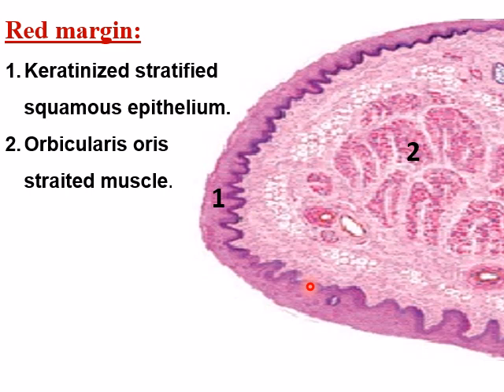As you see here, dear students, this is the red margin. Between the skin and the mucous membrane, there is a margin known as the red margin, covered with keratinized stratified squamous epithelium, and it does not contain any hair follicle.